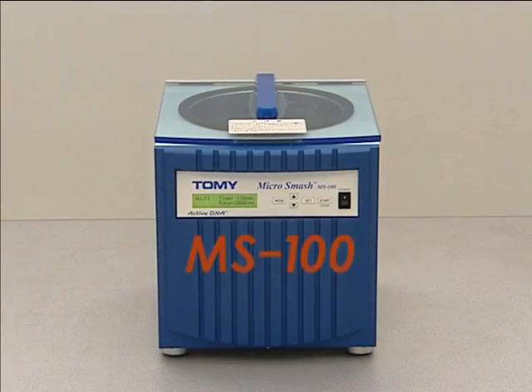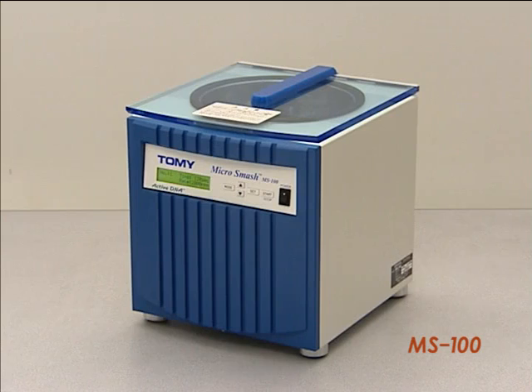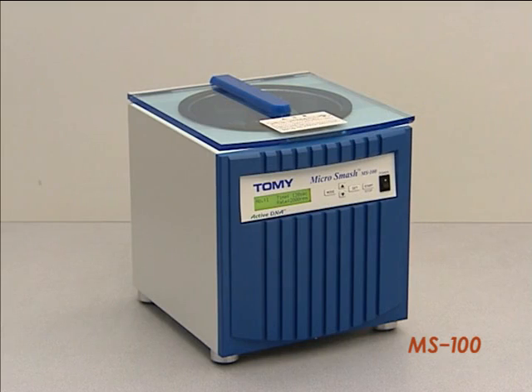The MicroSmash MS100 is an optimal bead cell disruptor suitable for extraction and purification of DNA and RNA. It is also useful for disruption and emulsion of environmental samples such as soil and paint.